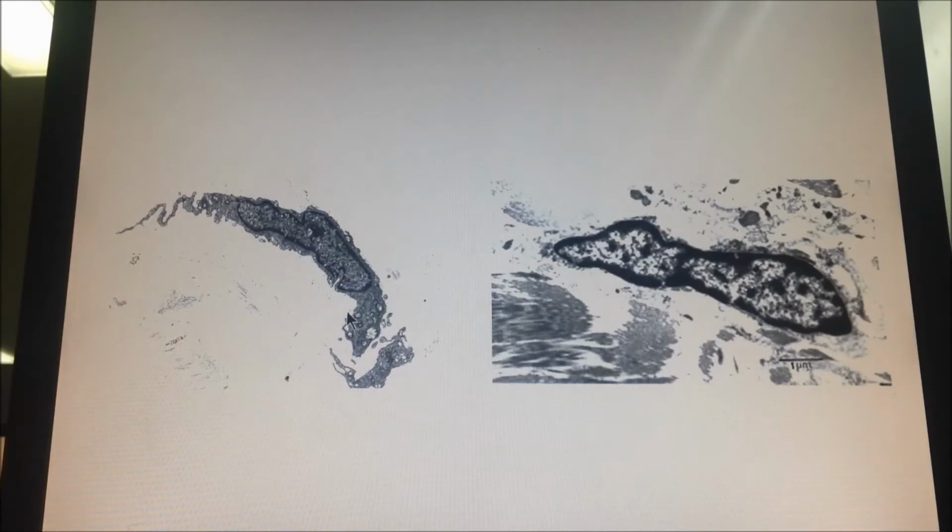Number three, the plasma membrane itself is irregular, multiple processes, multiple villi, pseudopodia طالعة منها. هذا دليل الأكتيفيتي. It's a branched cell. طالعة منها multiple processes, irregular plasma membrane. طبعا fibroblast, it will synthesize the whole components of the matrix, the collagen والground substance، والcollagen والelastic fibers, etc. هي mainly proteinaceous fibers.